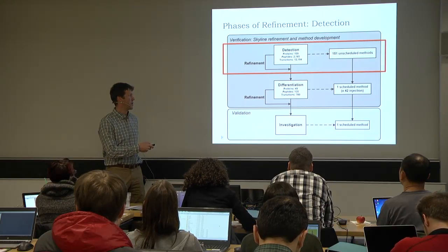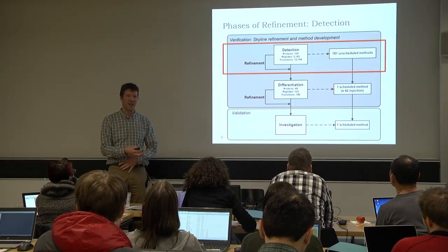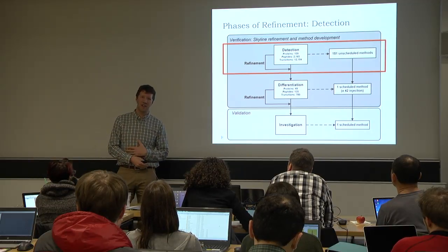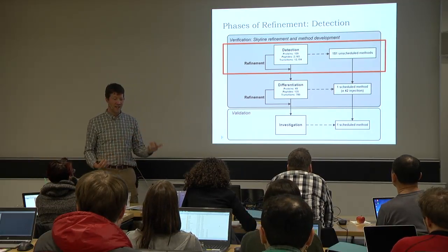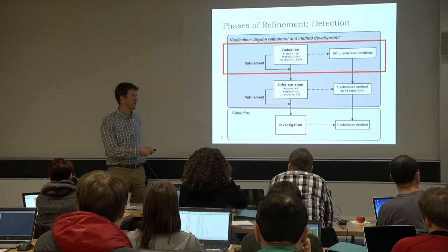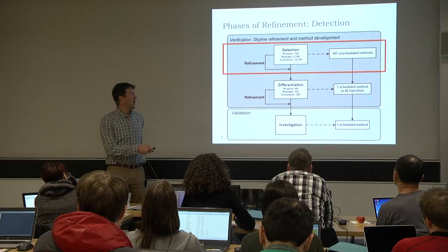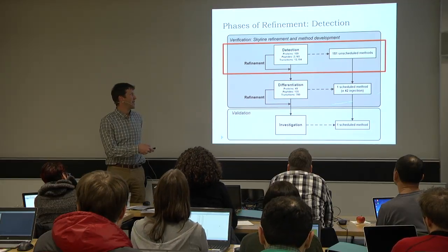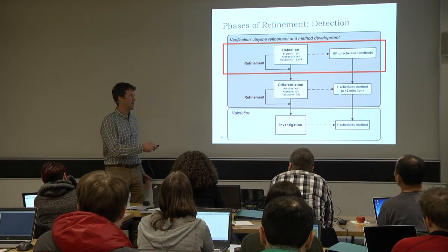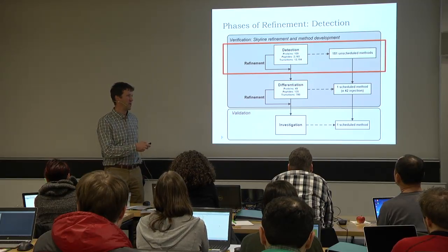And that was also 135 peptides, resulting in about 780 transitions, which we were actually able to get down to measurable with a single injection. And this is with an older mass spectrometer. Newer mass spectrometers would have no problem with this in a single injection, but we created a scheduled method. And then our hypothesis was that we could take this into a next phase, measure all 42 injections, 14 replicates 3 times, and then we would have some idea.